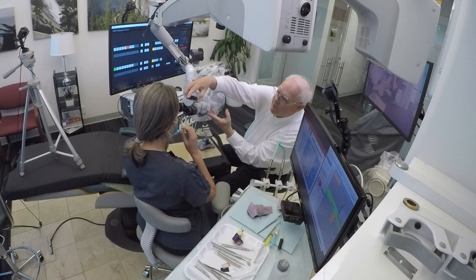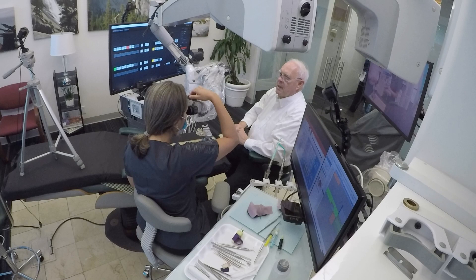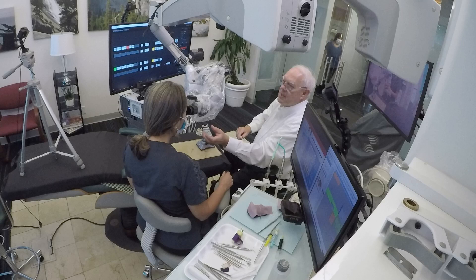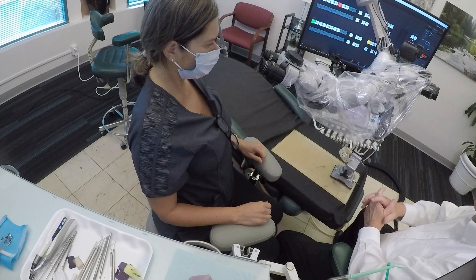You move this back and forth until you have one image — you have to kind of play with it. One way to get used to this is to back off a little bit, so you don't have your eyes pressed up against it. You're backed up a little, usually.